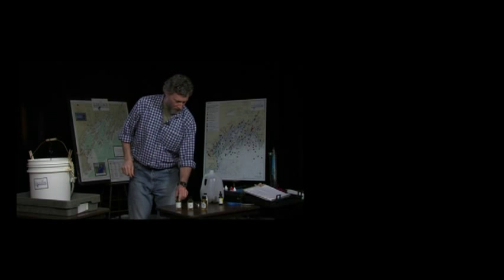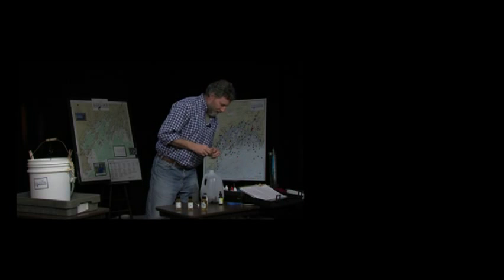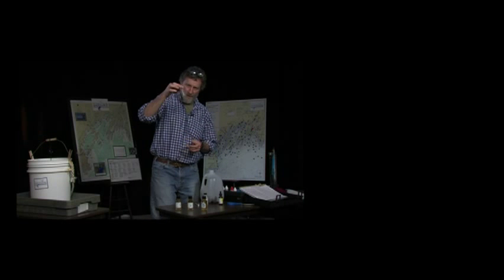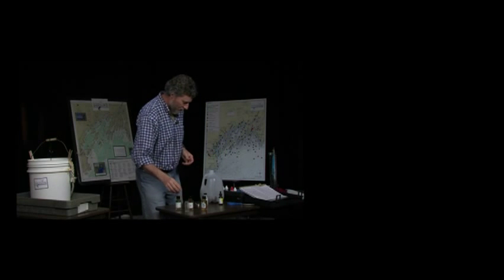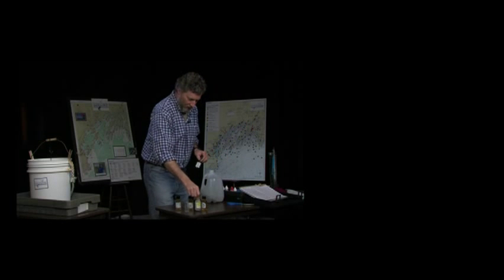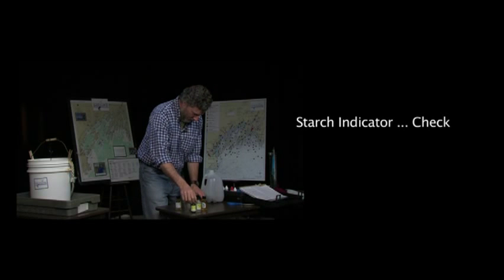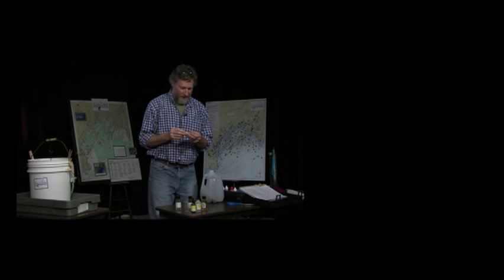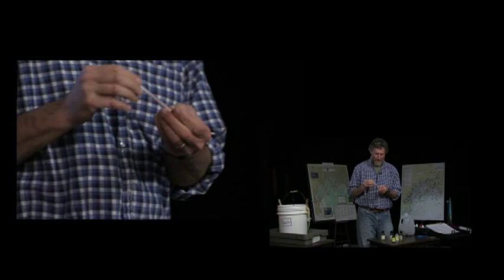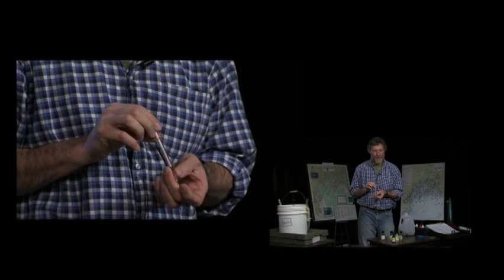We're going to need a couple of pieces of equipment. One, that is a titration tube. We're going to need some sodium thiosulfate. We're going to use a little bit of a starch indicator. And we're going to use this syringe. This little syringe is called a titrator, and it has a scale from 0 to 10.